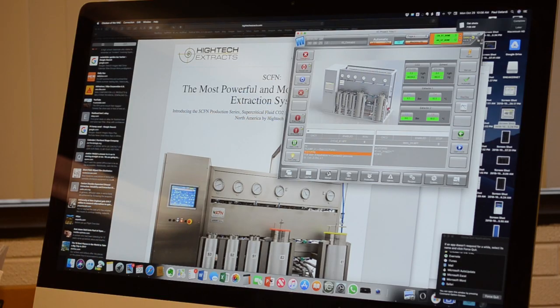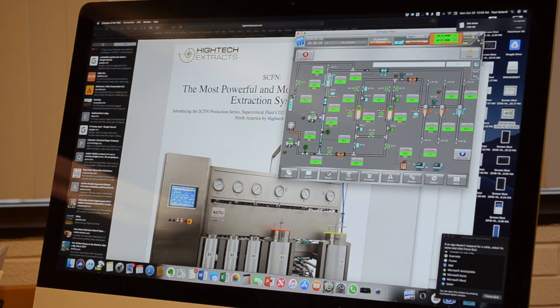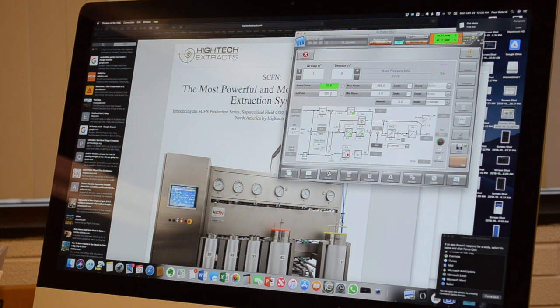I can also make changes from my desktop. In the earlier screen, I changed the pressure setting. And now I want to change it back to what it was originally set at. And so I've just changed the control of the system. I just took control of the system and changed the parameter from my desktop.